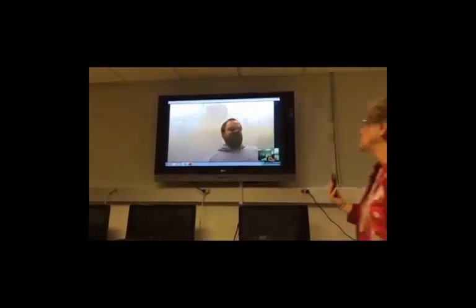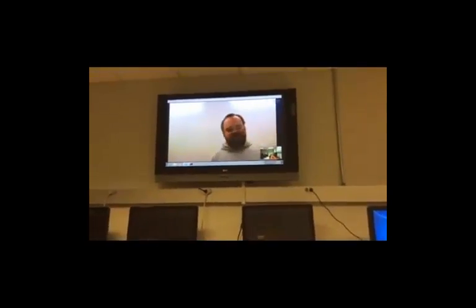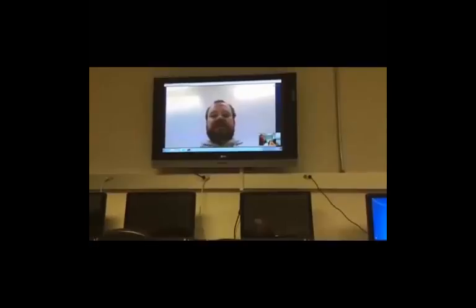There's a big screen in the computer lab. They can see you very well and hear you. All right, so I just went ahead and turned on the gases, so we have that ready to go for you. Okay, let us know when you record. Yeah, I think I'm ready. Yes, thank you, Dana. Okay, so she's recording.